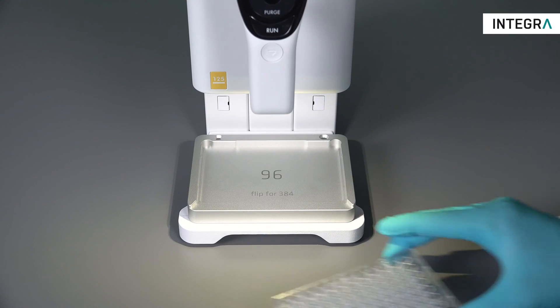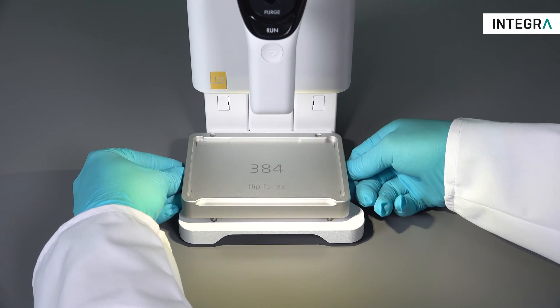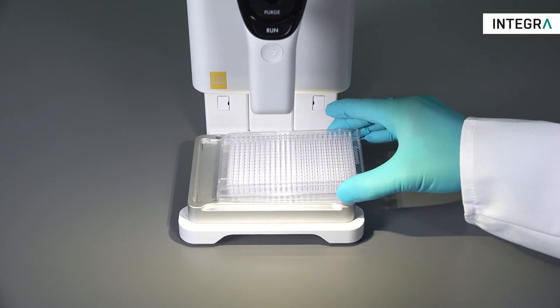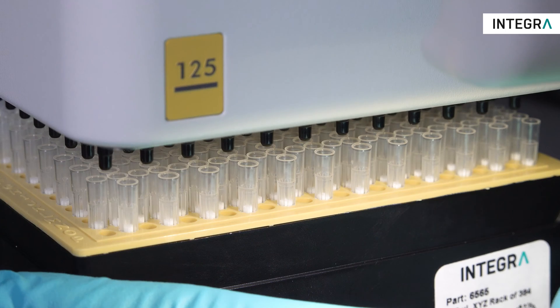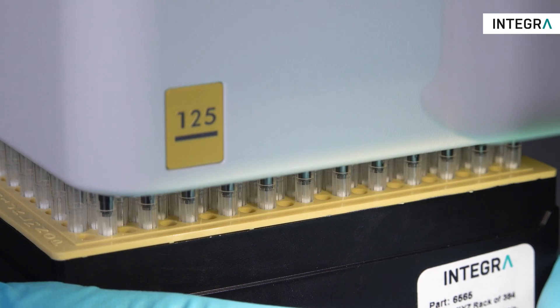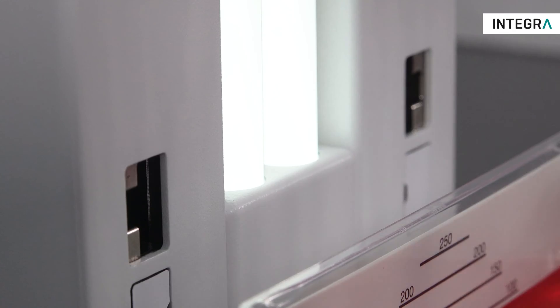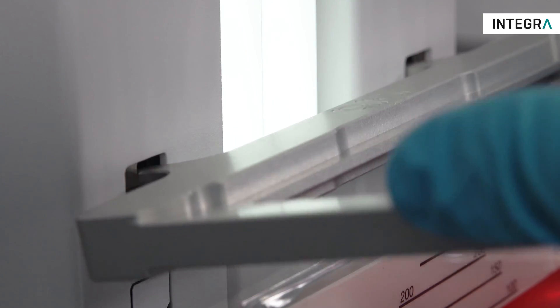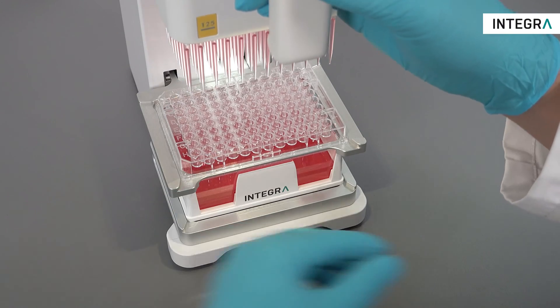The main working position is called the base stage, and can accommodate 96 and 384 well plates — simply flip the plate to access both sides. Grip tips are loaded and ejected electronically for a perfect and easy loading experience every time. For those who want or need less handling of labware, a second stage can be used to pipette into the target plate while the source stays below.